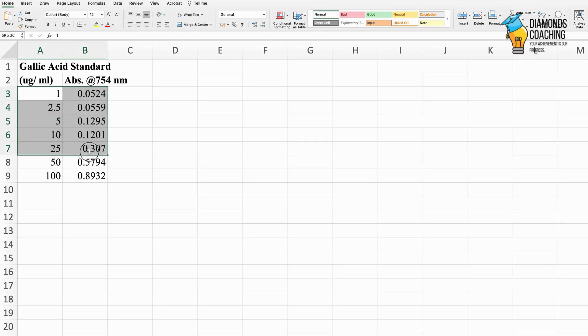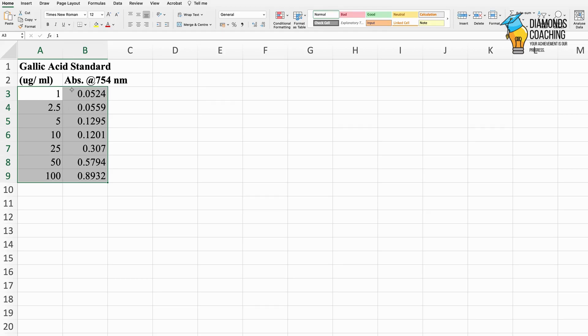I'll select all this data. Always remember that the column on the left side would be x and on the right side would be y. So the data will be plotted with concentration on the x-axis and absorbance on the y-axis.